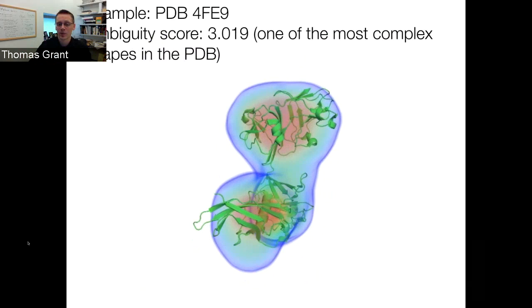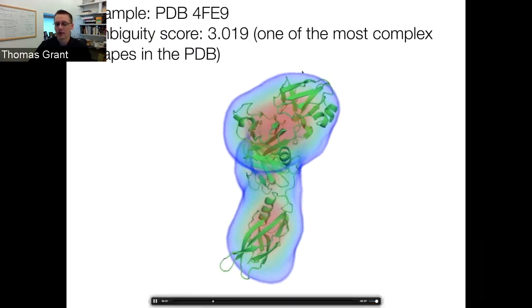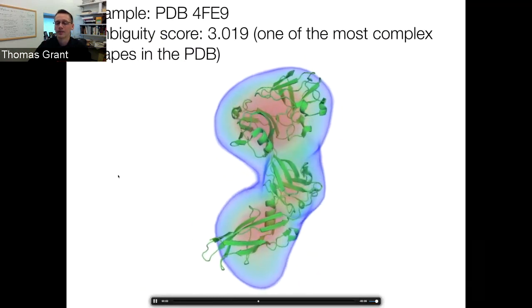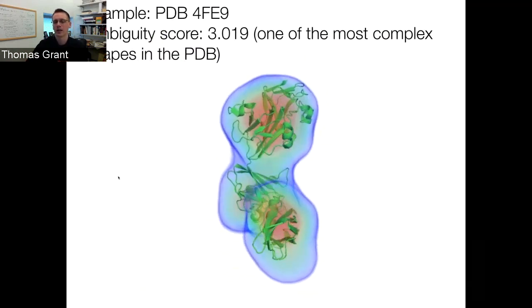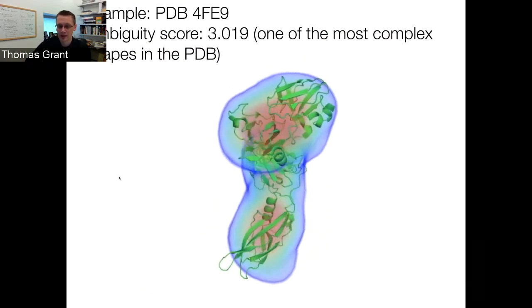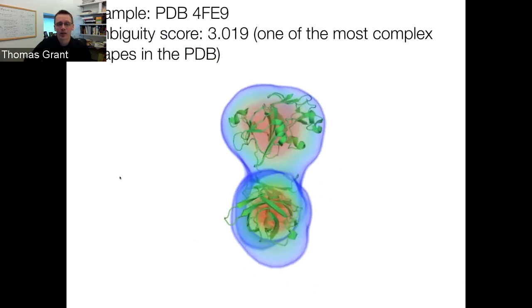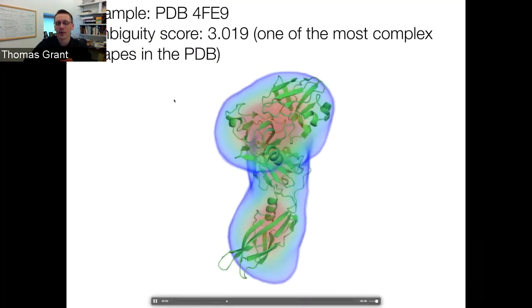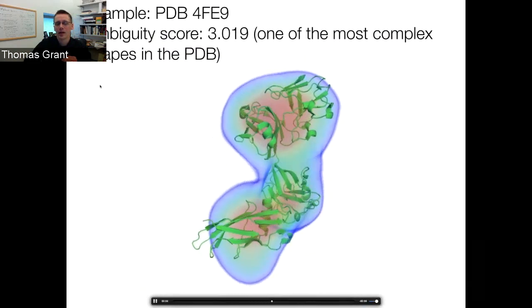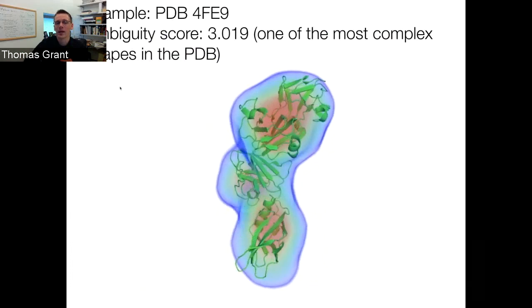And you can see in this particular case that it did a good job of doing that. This is a case where if you took the left-handed reconstruction and averaged it, you would just average out to something that's then symmetric, which clearly this is not. This has a clear handedness to it. I also chose this example because it's a very ambiguous shape. If you look at something called AMBIMETER, it's a way to score how complex a shape is.